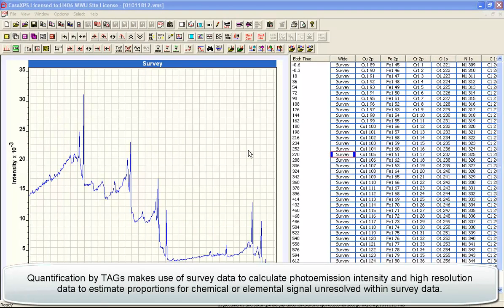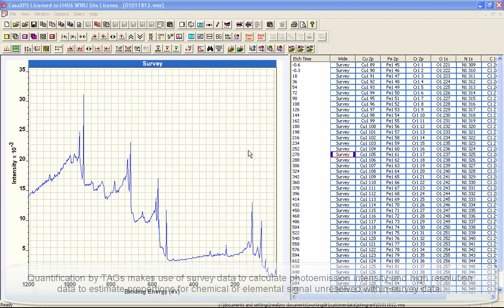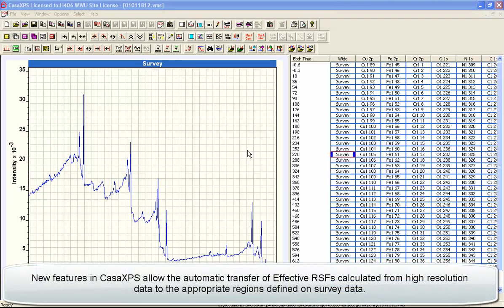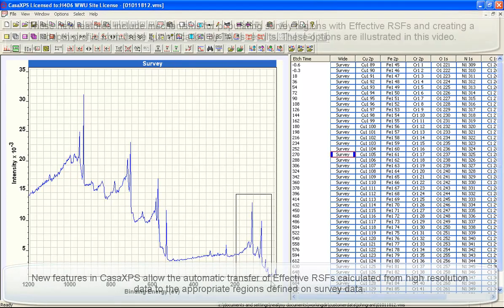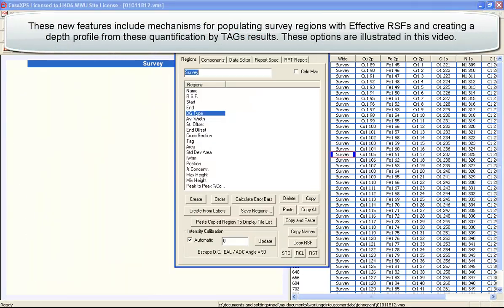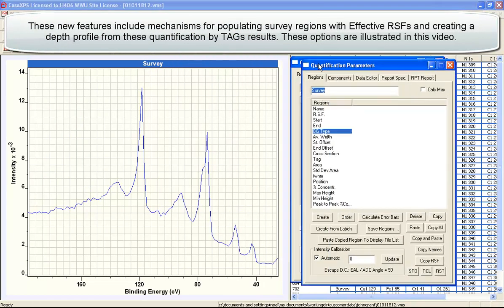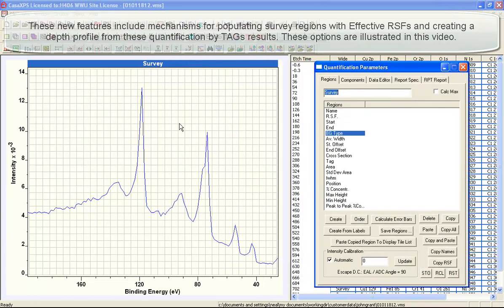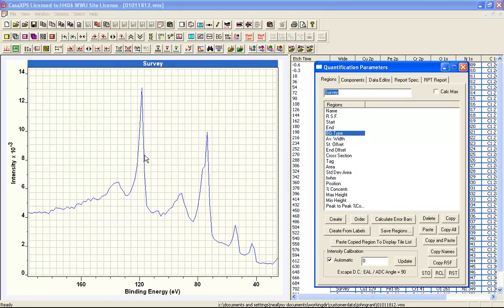In this video, we're going to look at quantification using tags. To introduce the problems of quantifying data such as these, we'll look at the basic mechanism by which quantification is performed — the Quantification Parameters dialog window. The idea is that we isolate a peak that we can assign to a given element.